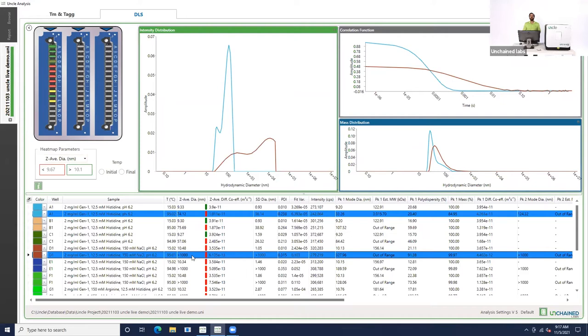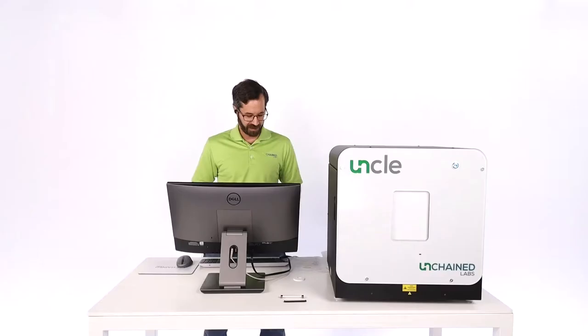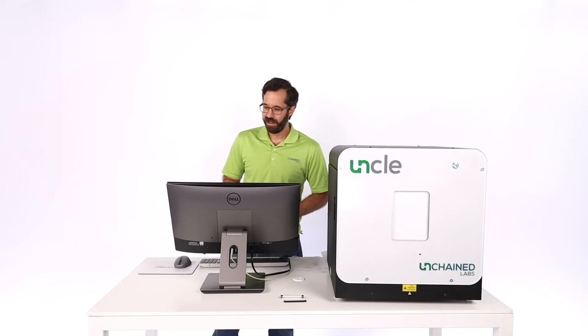Based on that information, you can make a lot of interesting comparisons and rank the relative stabilities of these different buffers to figure out which one might be the best candidate for continuing formulation studies. I think that's all the data I want to show, so I'm going to stop sharing my screen. I think we've probably got some questions that have come in from the audience, Kevin.